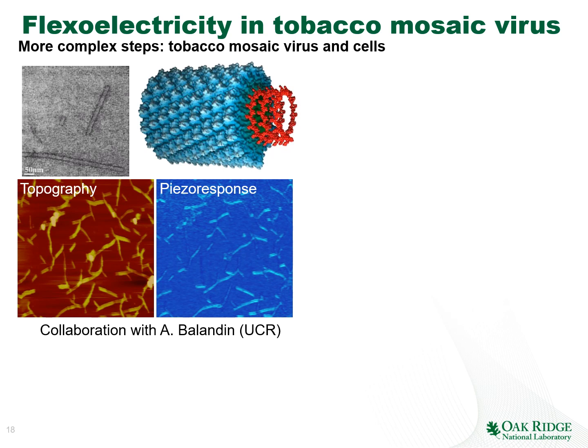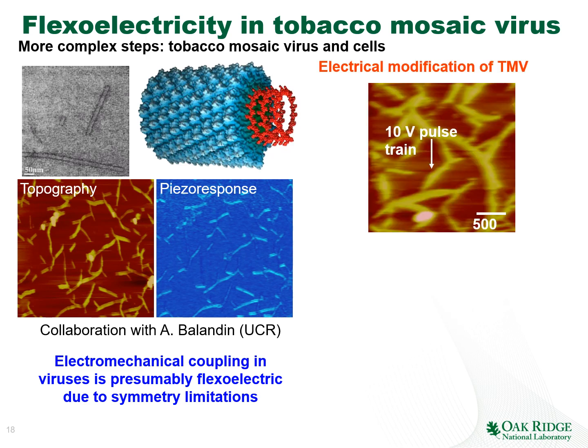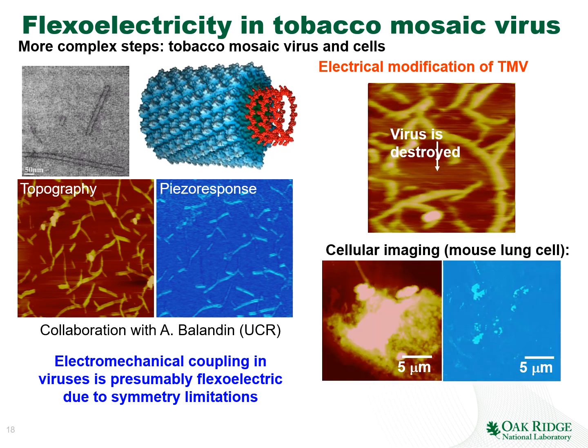Because the system is clearly symmetric, and therefore the piezo effect should be cancelled. So the assumption is that in this case the electromechanical coupling is presumably flexoelectric due to the symmetry limitation, and a few years later similar conclusions were derived by much more fundamental studies out of the Berkeley group. What's interesting is that we can actually modify the viruses using the PFM. In this case I have a virus, I have applied bias to it, and then I can just destroy this virus. This is something that we will talk more about in the consequent presentations.